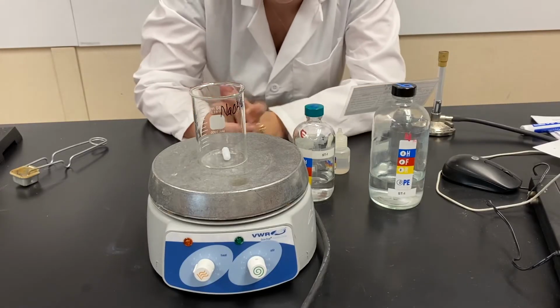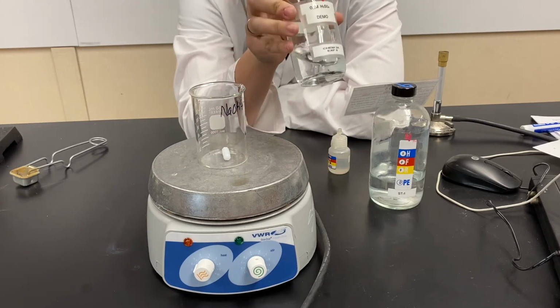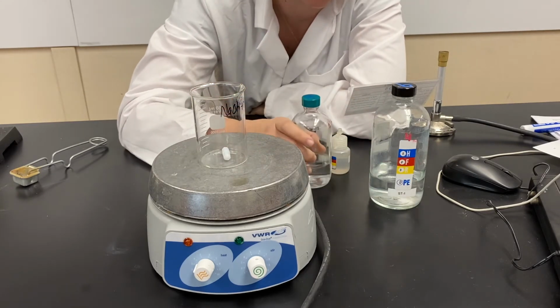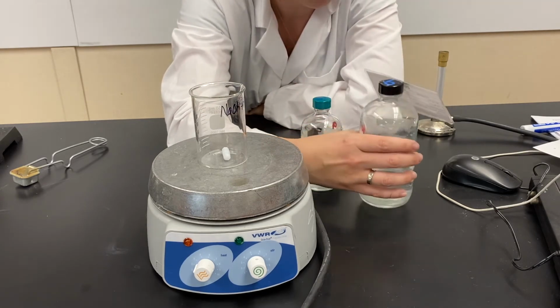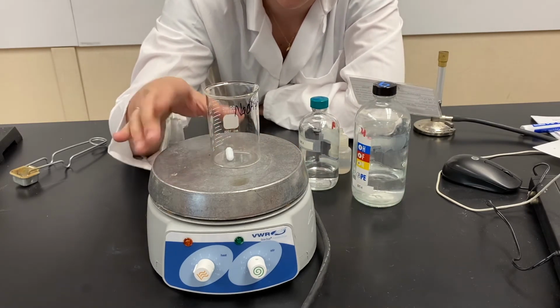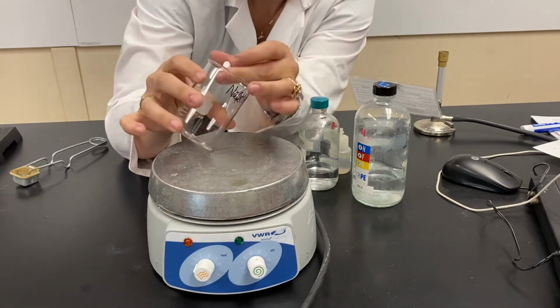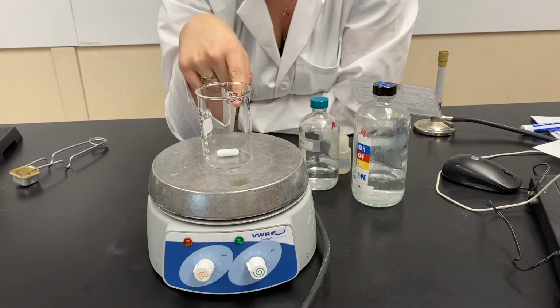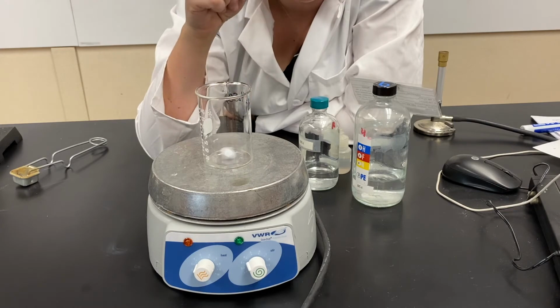All right, next in our double replacements, we are going to have 0.1 molar sulfuric acid mixed with 0.1 molar sodium hydroxide, okay? And what we're going to do is, yes, this is a hot plate, but we're not actually using the heat part for it. We are going to use a magnetic stir bar inside our beaker, and we are going to turn on the stir function so that when my solution actually gets in there, it's going to stir up the solution. Cool, okay?